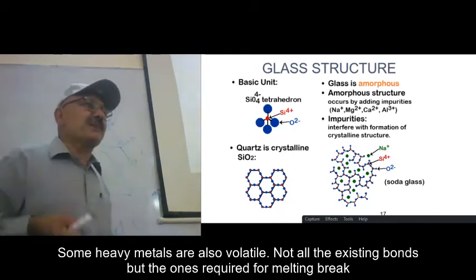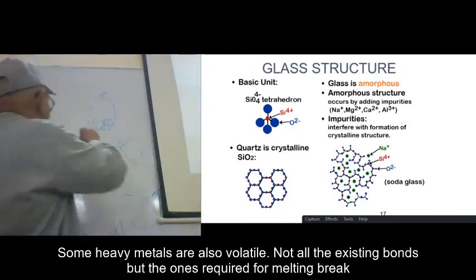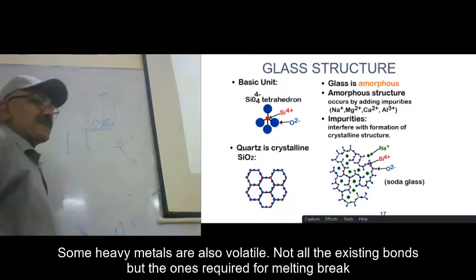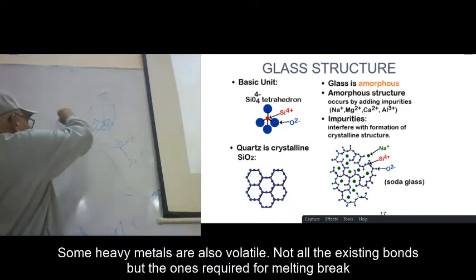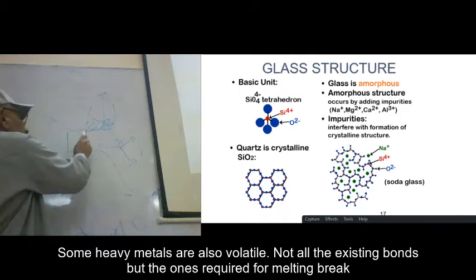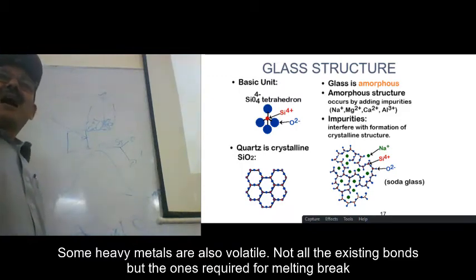Think about it, visualize it. The same things. Here is a point, for example, this is the unit cell. And the X-ray beam is coming and hitting this place. Now, if this plane is fixed, what will happen?